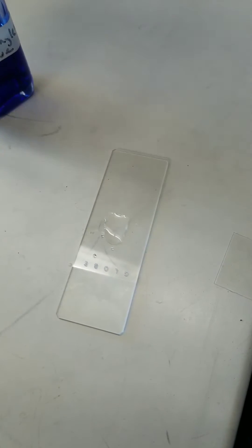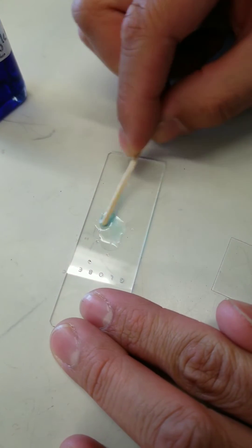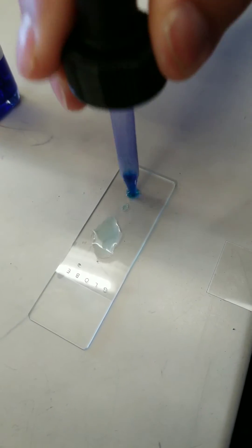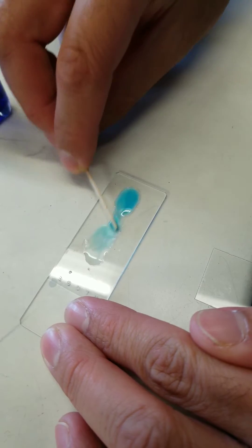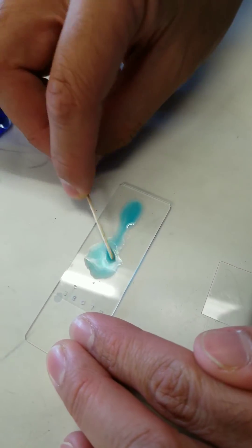Now I'm going to take some dye — it's called methylene blue. I only need a tiny, tiny bit of it. And I'm going to mix that dye in. I might need a little bit more — this is more dilute than I remember. Mix this methylene blue in with the epithelial cells.